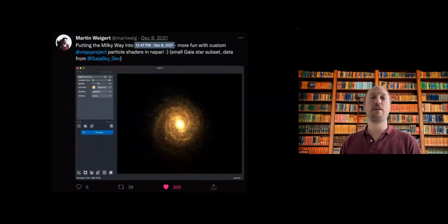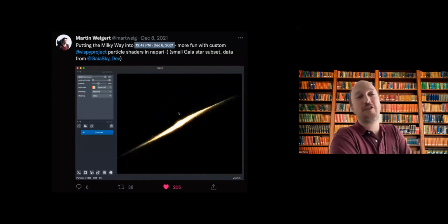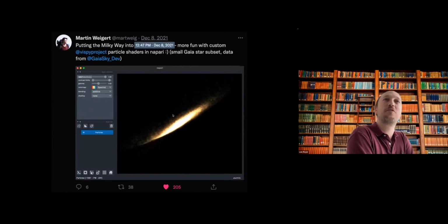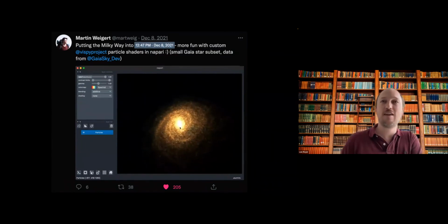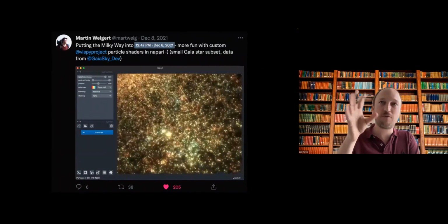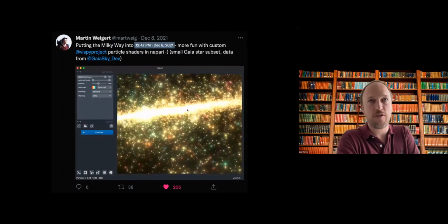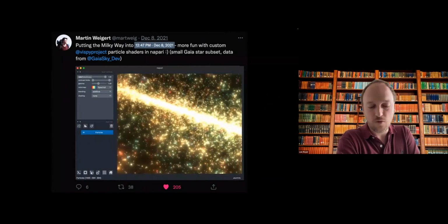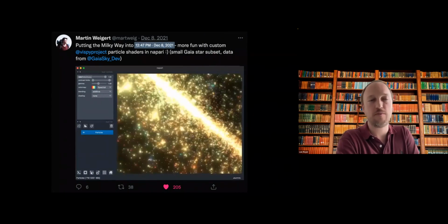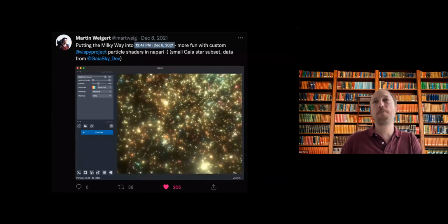We also have people like Martin playing with nice data sets from astronomy from the Gaia Sky project, and doing some very nice animations. We're also thinking of using that for single molecule super resolution data, based on single molecule detection and so on.